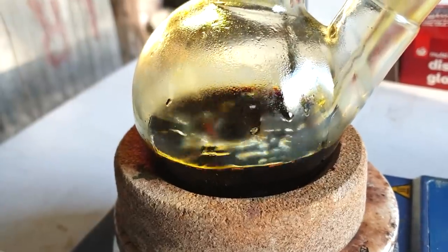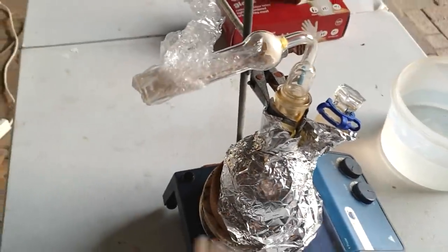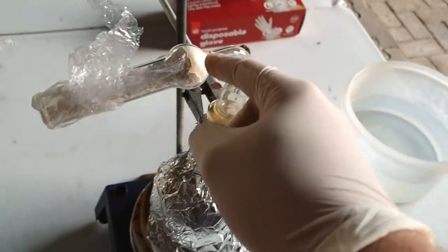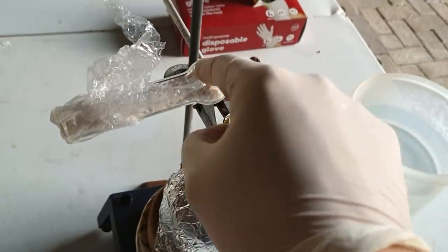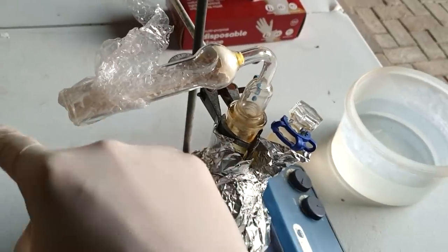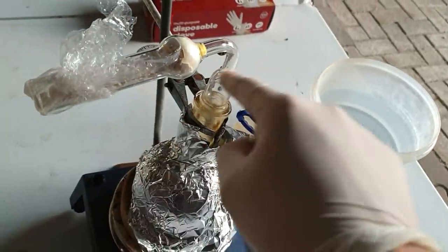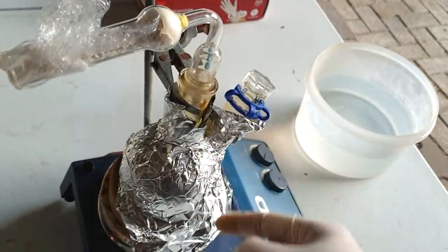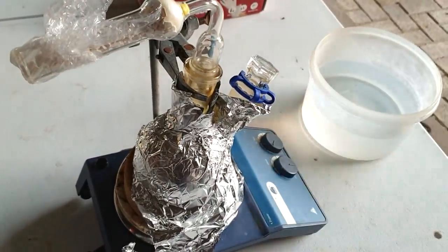We will continue on. All right, I've just done now what I probably should have done at the start, which is put a drying tube on. This allows gas to escape because it's packed calcium chloride in here, and any air can go back this way, but it gets stripped of its moisture by the calcium chloride. So you can have gas exchange, but you can't have any moisture get back into the flask. Oh, I don't know. Maybe it could have had a stopper. It's not venting that much HBr gas.